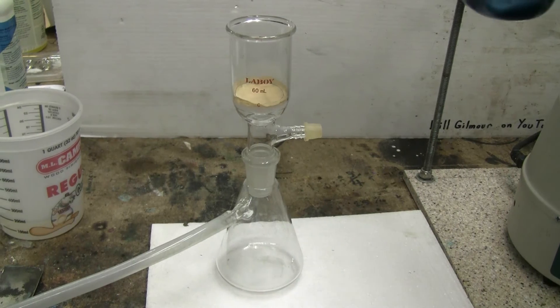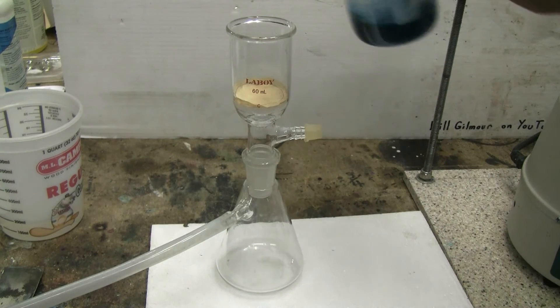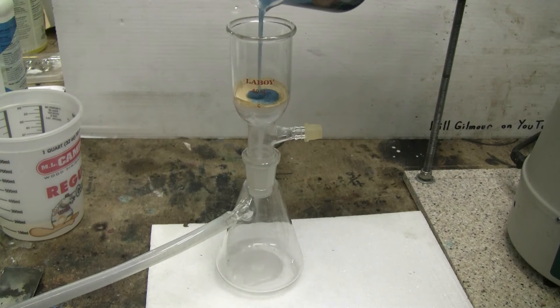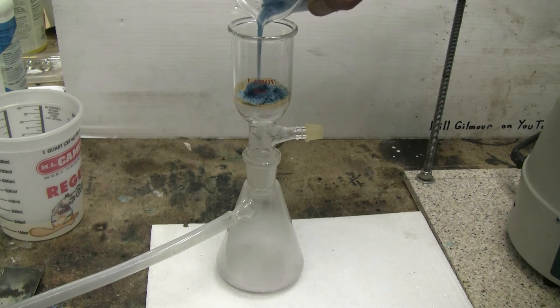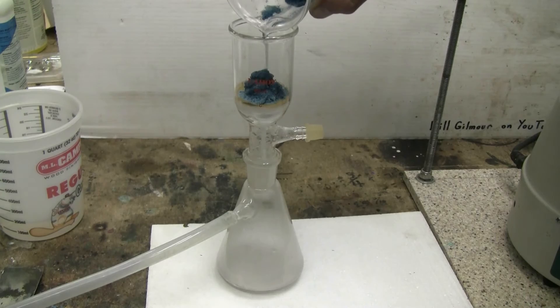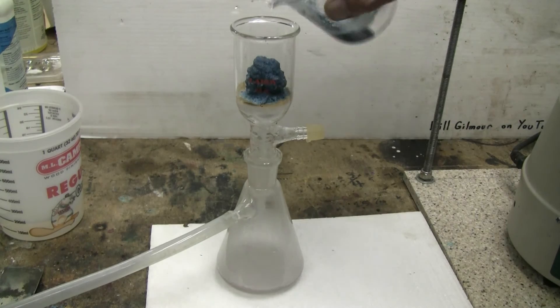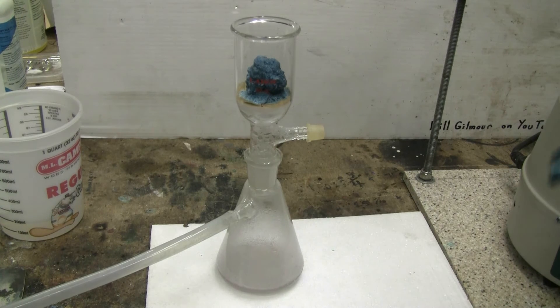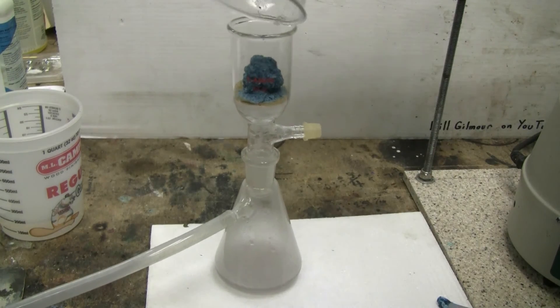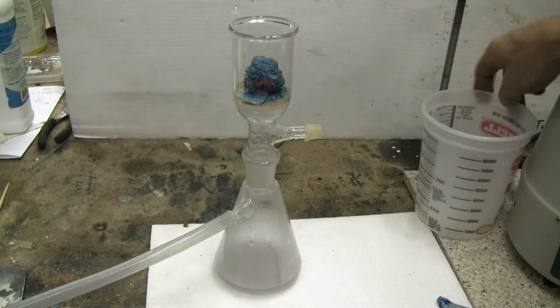I've set up a small vacuum filter apparatus and I will now filter the copper aspirinate. I'll need a little wash water to help it out of the beaker.